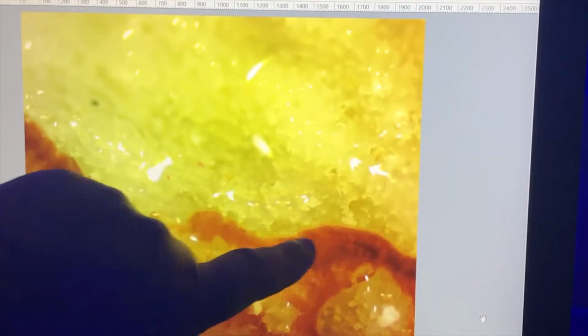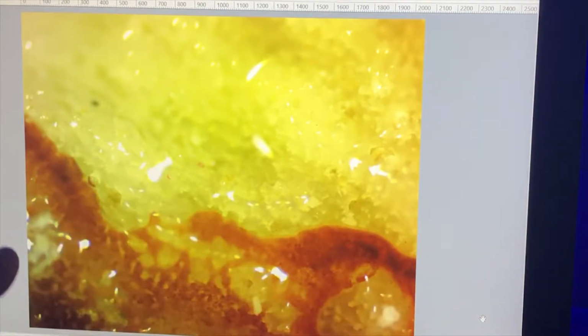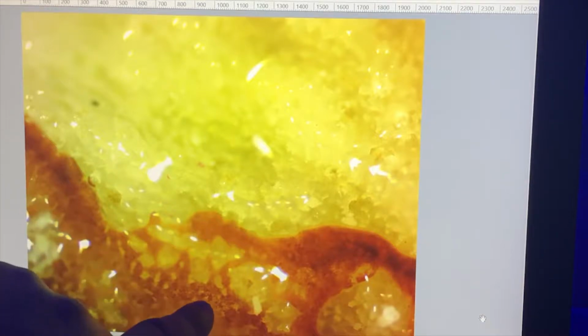So we're going to go ahead and take a look at the microscopic examination of the tissue. And you can see here, this is coral tissue, and this is right at the zone of necrosis, where the necrosis was happening. This is skeleton, the white. These are basically very unhealthy tissue of the Montipora. You can see small little zooxanthella.